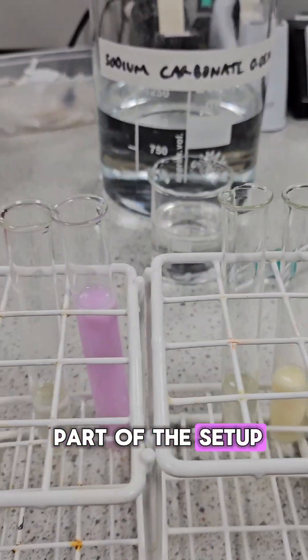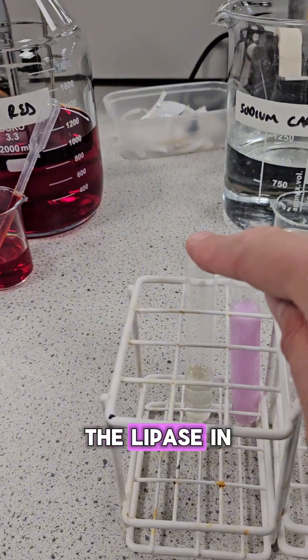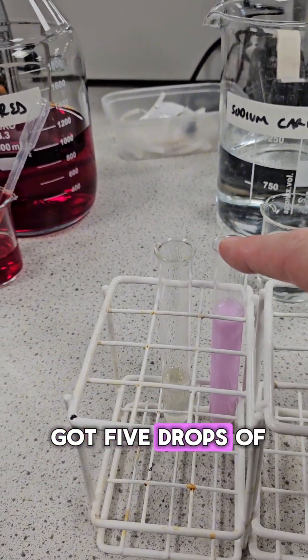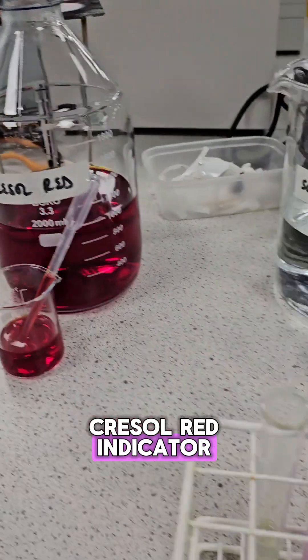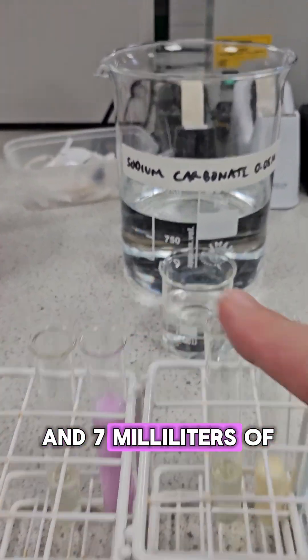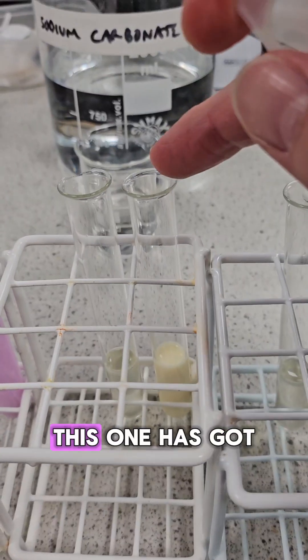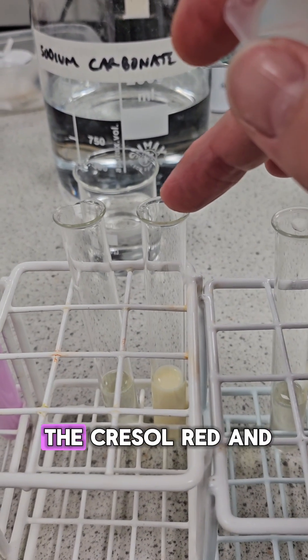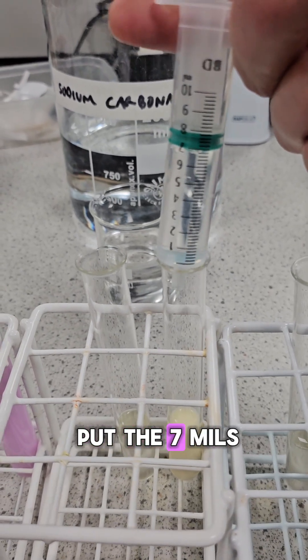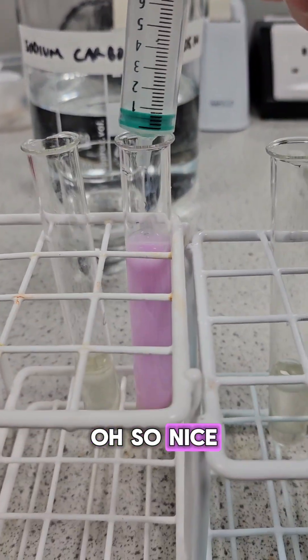So here's the next part of the set up. Each of these is going in a different water bath. This one's got the lipase in, and this one has got five drops of cresol red indicator, five millilitres of milk, and seven millilitres of sodium carbonate. And when you put the seven mils of sodium carbonate in, it goes a lovely purple colour — so nice.